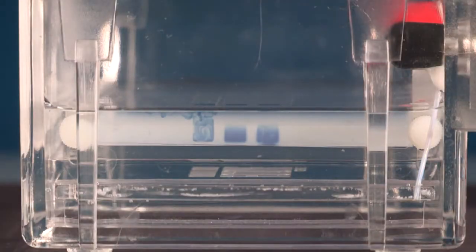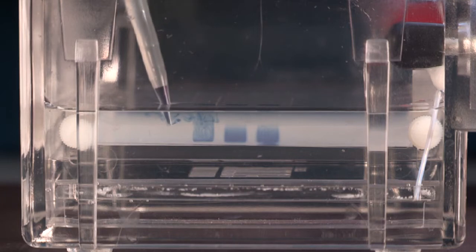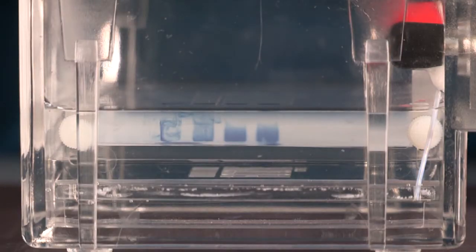Another common mistake when loading a gel is when you apply the sample, if you put the tip of the pipette too much into the well, you can sometimes pierce the bottom of the well. And when you apply the sample, it's actually gone through the bottom.